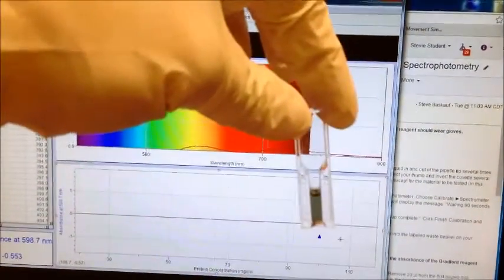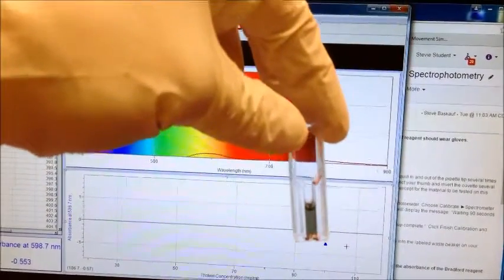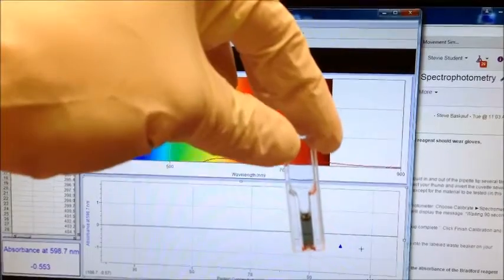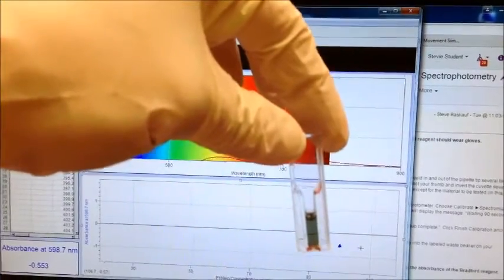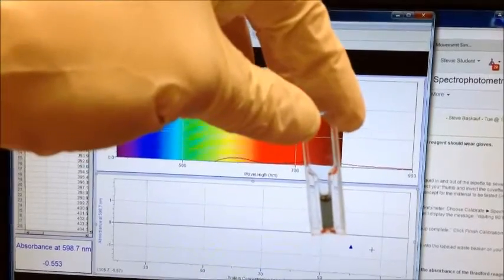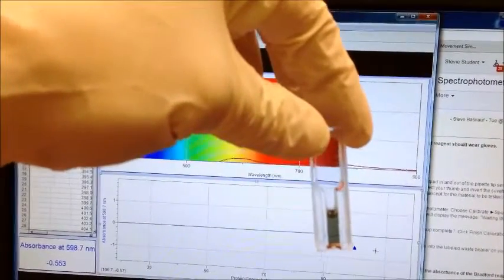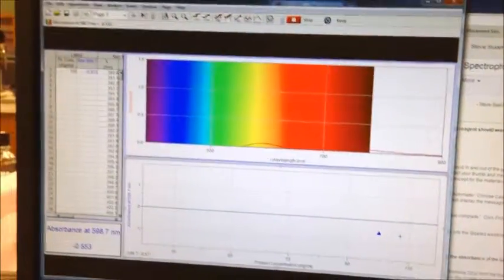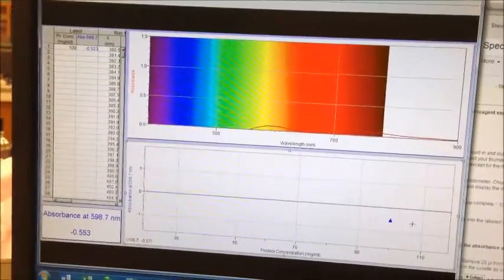Well, look at the tube. The tube is only halfway full, which means that some of the light was passing through air instead of through blue. That means that the amount of absorbance is lower than it should be. When the blank is subtracted from it, the answer is negative.